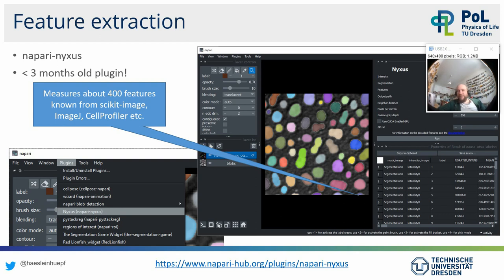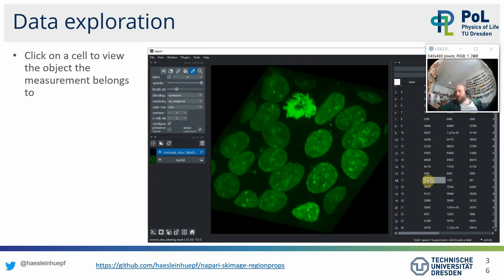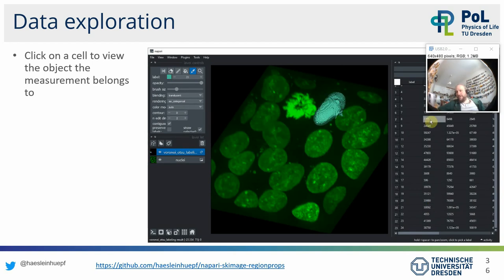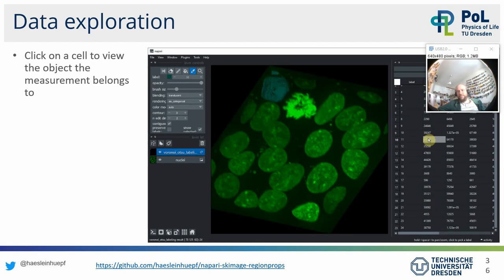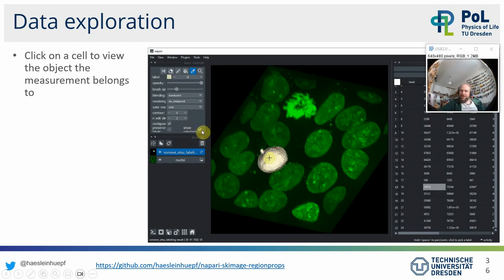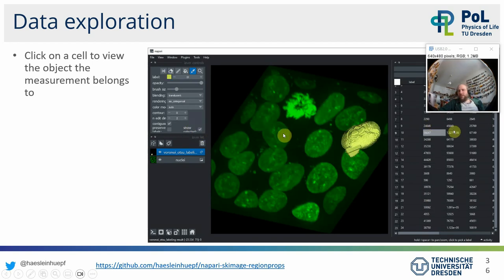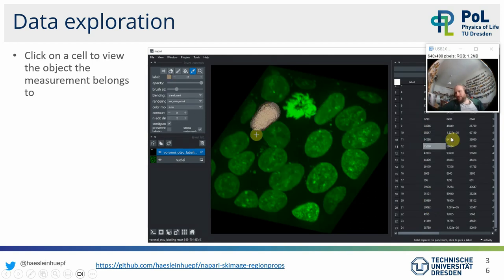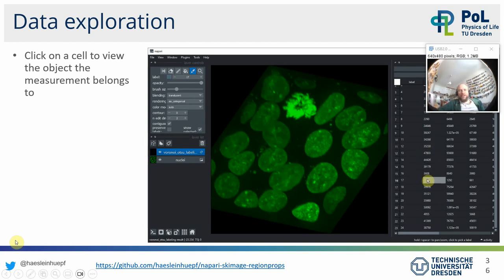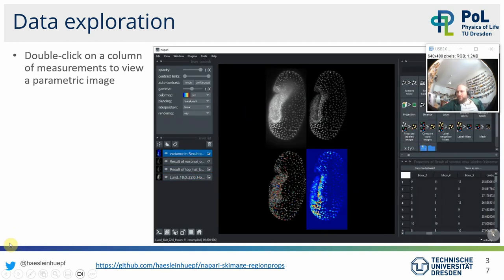Napari Nuxus makes life easier by consolidating features from multiple libraries in one place for feature extraction on objects. Depending on which library you use, you can then interact with the result table. You can double-click on elements in the table — with the show-selected checkbox activated — to highlight the corresponding object. You can also pick an object and see which measurement in the table it belongs to. That's a feature many image analysts were waiting years for.